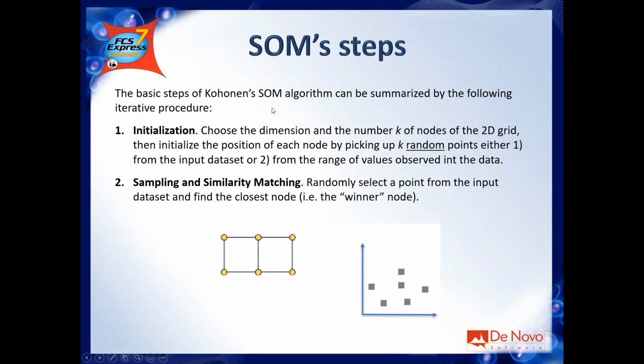There are several different calculations. The first one is the initialization. Let's take this example. This is like FL1 and FL2. Let's say I have here 6 points, 6 events. It's quite a small data set. I define my grid. In this case, it's not 10 by 10, it's like 2 by 3.